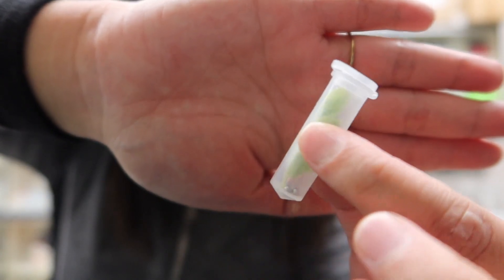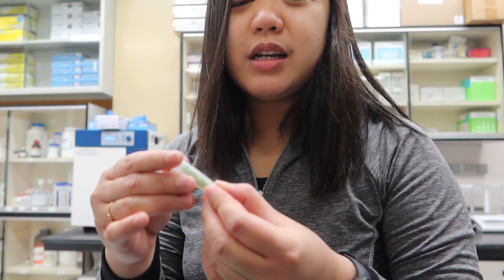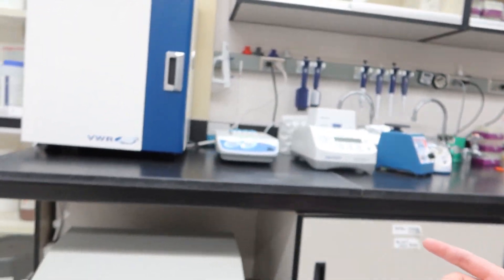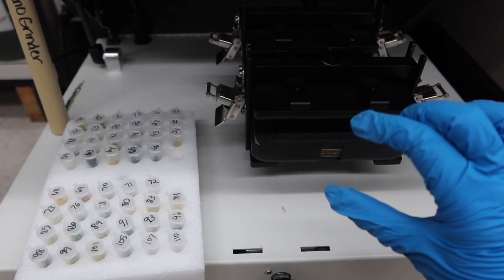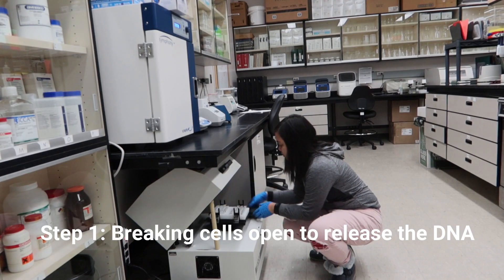Ito ay tubes na may mga beads. Tapos, dahon ng chickpea. Ang unang part ng DNA extraction is to cut the cell open. Noon, ang ginagawa natin ay i-gunting-gunting siya sa tube. Natry ko din yung grind, at natry din natin yung liquid nitrogen. So ang ginagamit dito ay Geno grinder. Lagay natin dito yung mga tubes — ito yung mag-shake, mag-grind itong leaves with the beads. Step one: breaking cells open to release the DNA.